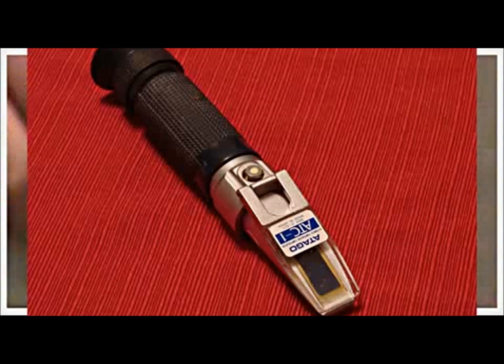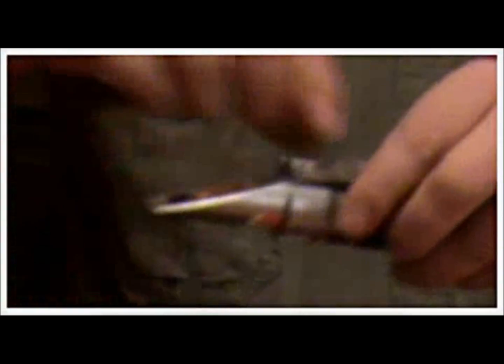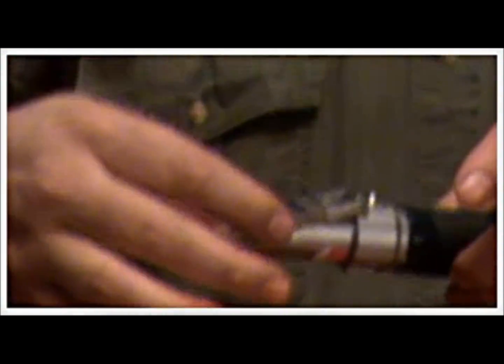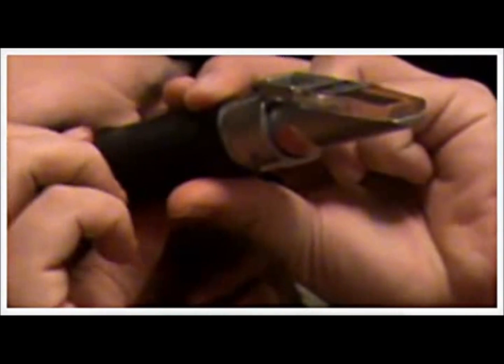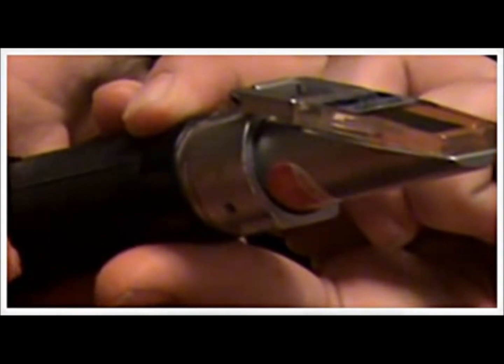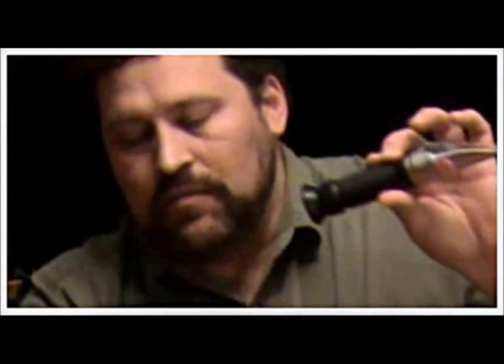To use the optical refractometer, we would just pull back this lens cap, squeeze a couple of drops right on there, close the lens cap, and make sure there are no air bubbles showing up. Then we would focus through and look — it's reading about 10.1, 10.2. Same number either way works.